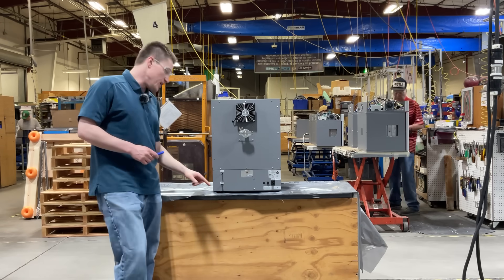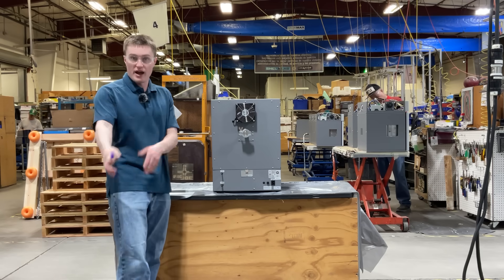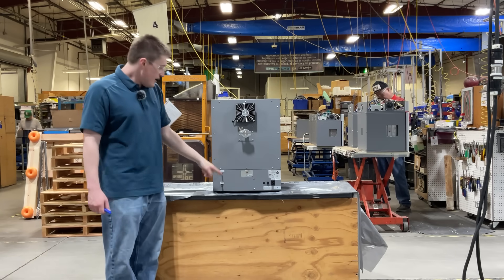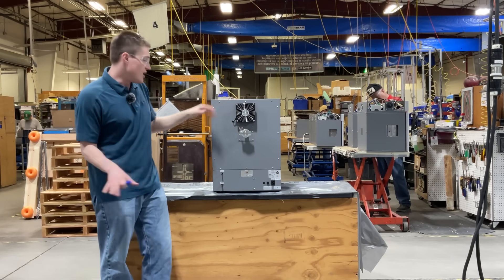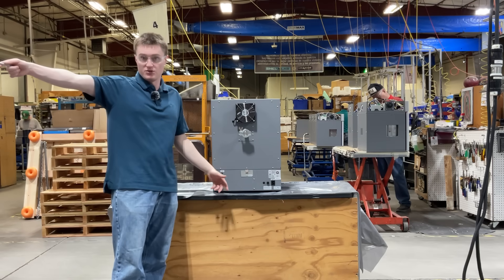Moving on, we have the vacuum and the vent tubes. The vacuum tube is where you connect your external vacuum supply to help pull a vacuum down in the chamber. The vent tube is connected to the vent valve and allows the user to vent the chamber gases out. You are able to either leave it open or plumb it to external tubing if you choose.